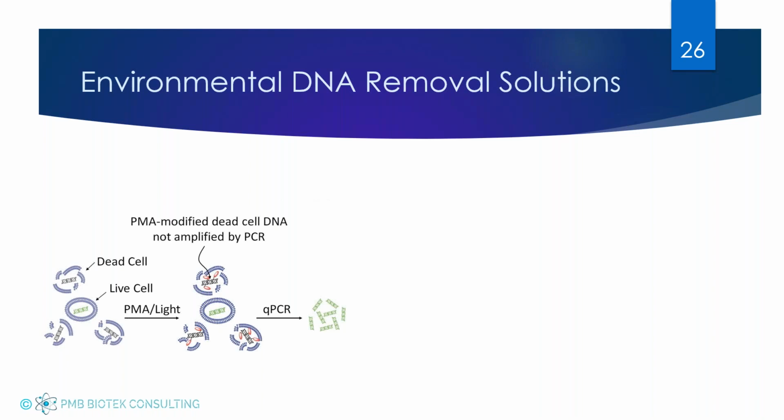The one thing with the DNA removal solutions, though, is that you really do have to clean up those chemicals prior to running your lysis. We have seen a 10-fold CT reduction in your PCR results. So if you had viable organisms there at 30 CTs, which is a moderately strong positive sample, and you don't clean up your DNA removal solutions, it could be as low as 40 CT values, which often is called negative in samples. So it really does have to be something that you evaluate and make sure you run that protocol accurately.